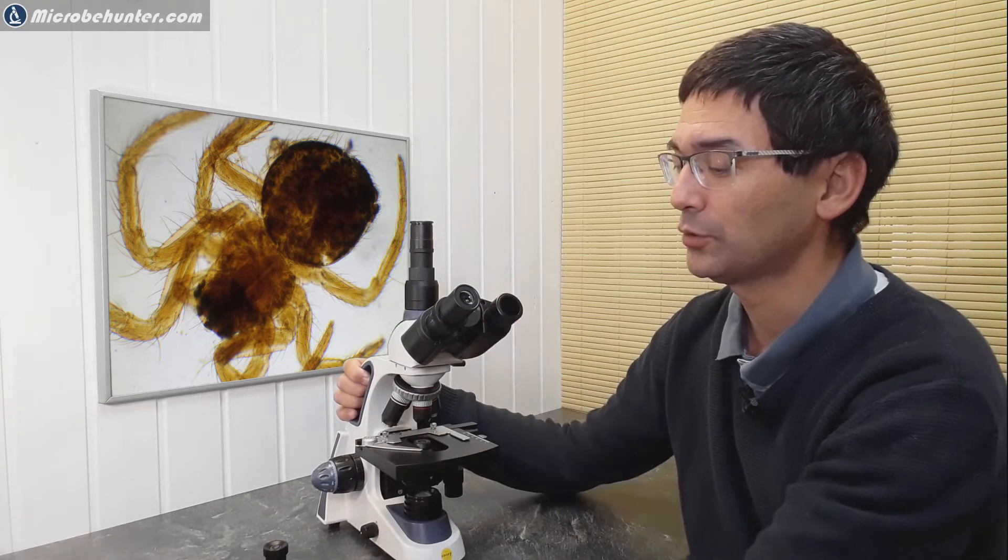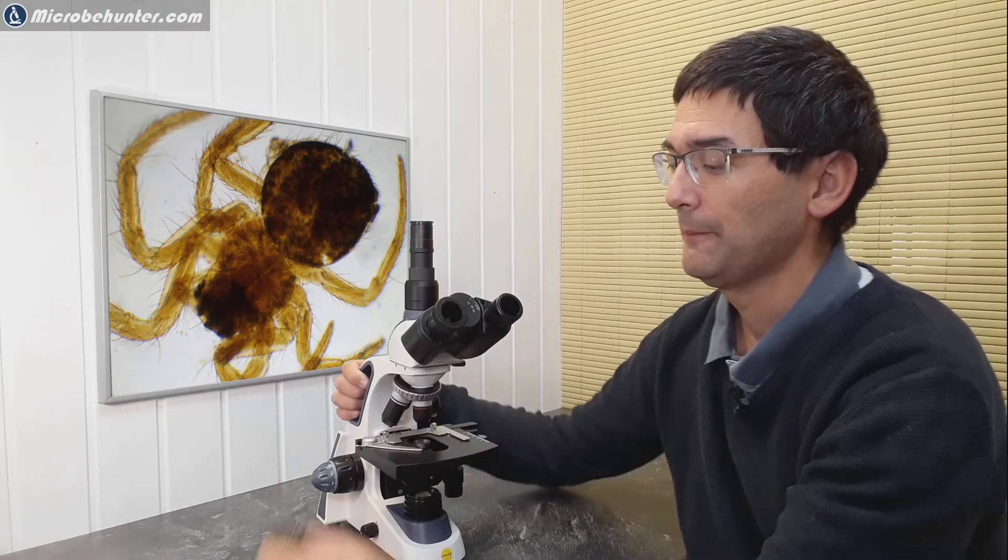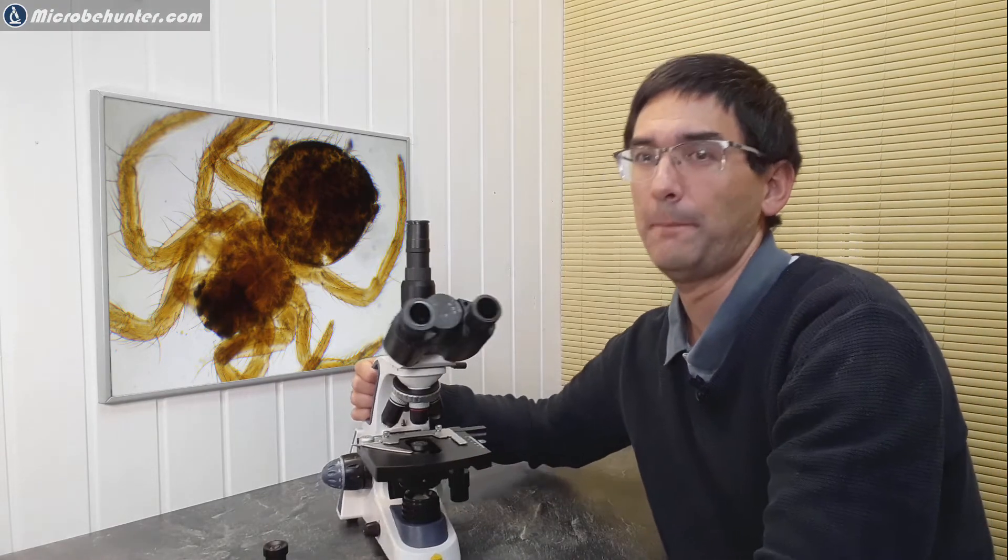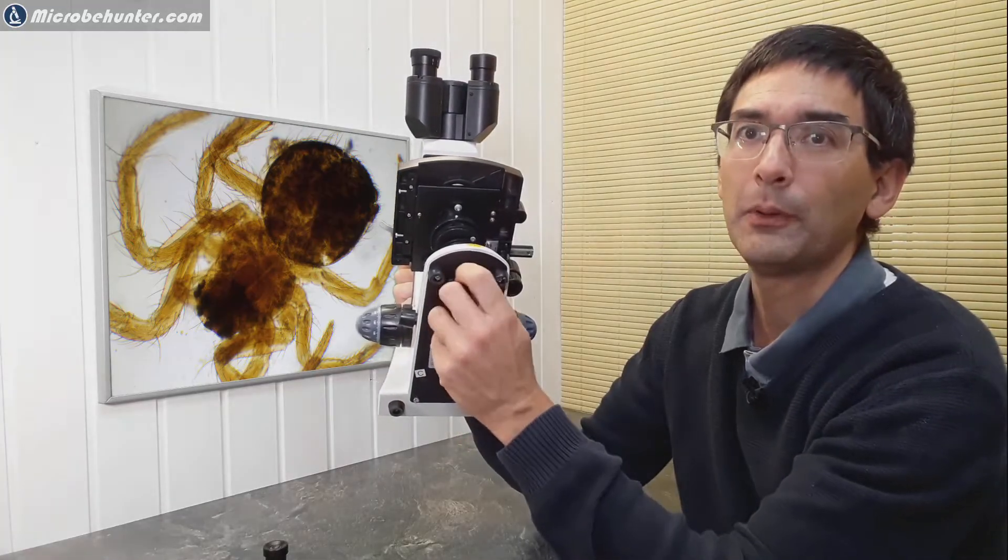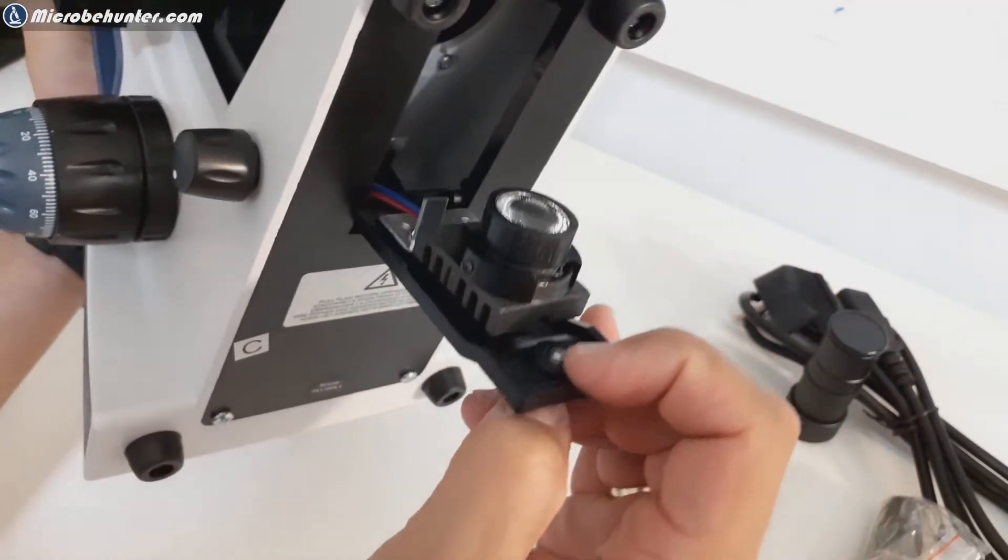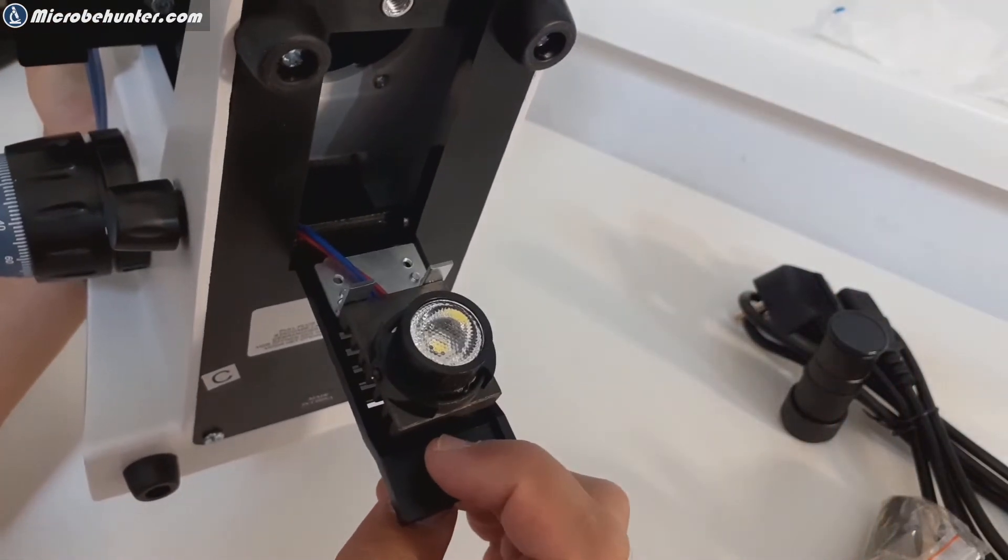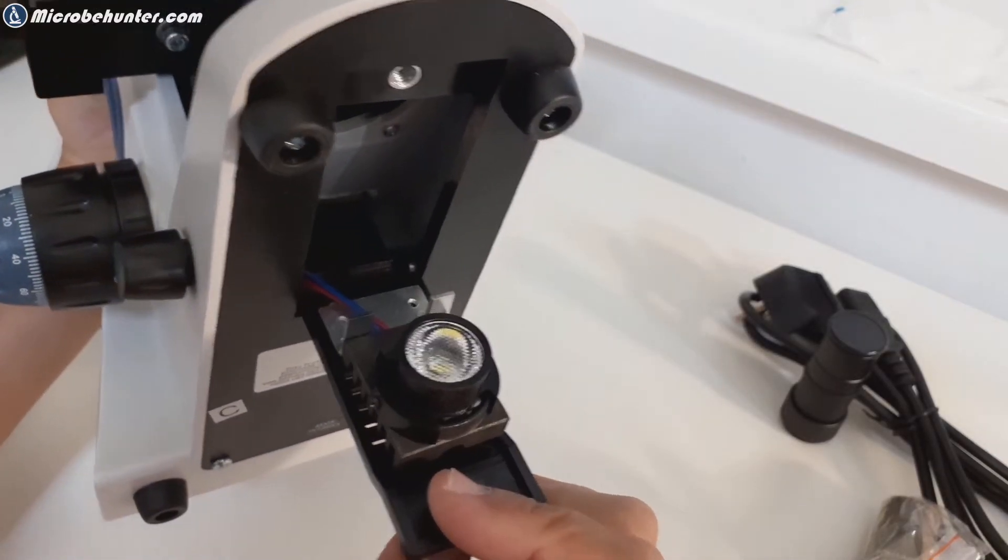If you actually open it up, I have to remove the eyepieces now so I don't want them to fall out. You can actually open up the bottom side of the microscope and then the LED is accessible.